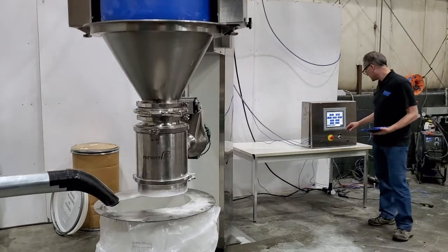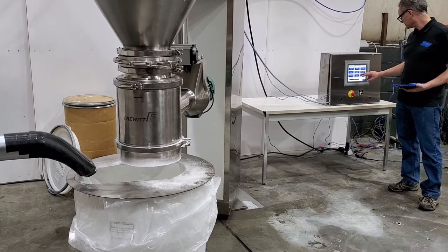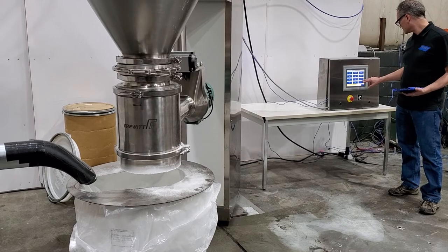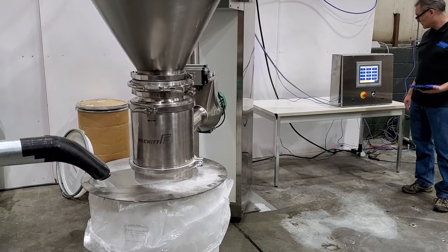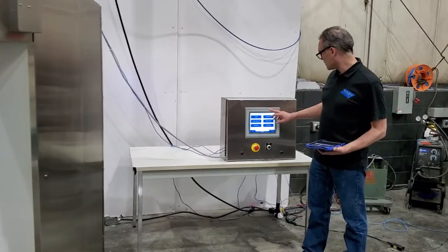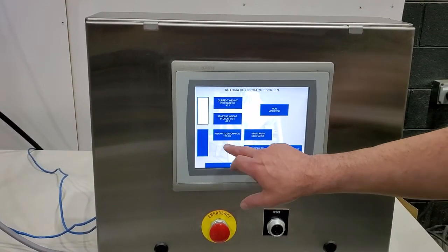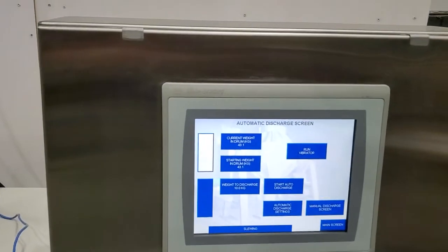So I'm going to turn that down a little more to this drum. I'm going to go to the discharge screen right now. We have a 12.5 kg discharge weight — let's reset that and we'll do a 10 kg discharge. We have 43.1 kgs in there now.